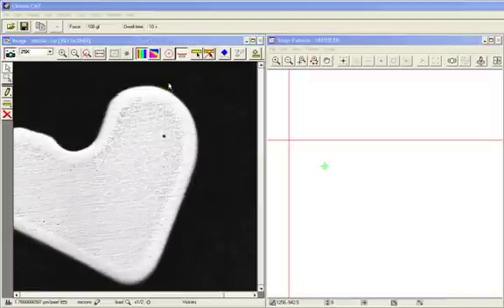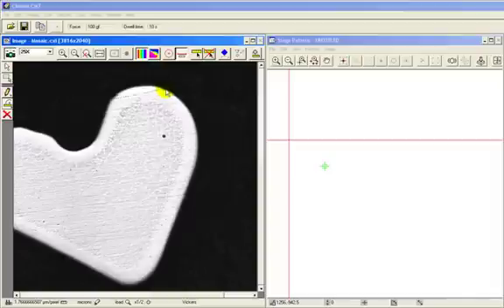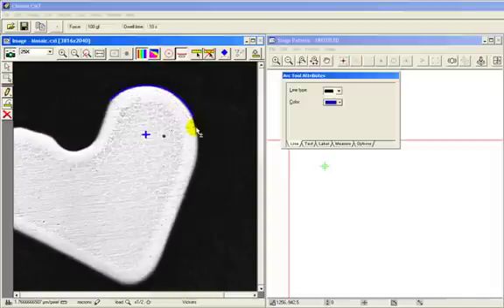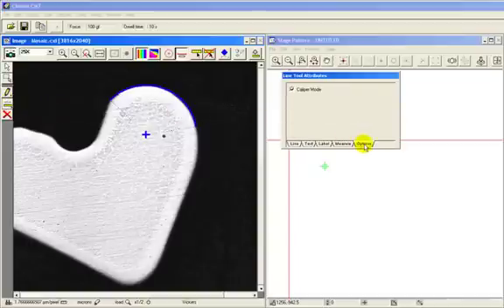Zooming in on the longest leg, we will first select the circle tool to find the center of curvature. This is followed up by the straight line tool in caliper mode to draw a line parallel to the edge of the arm.